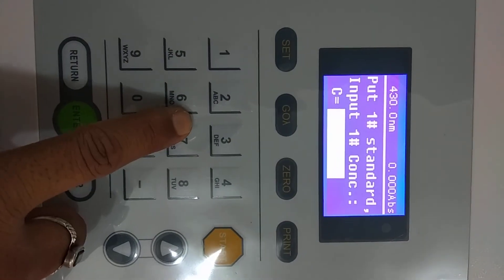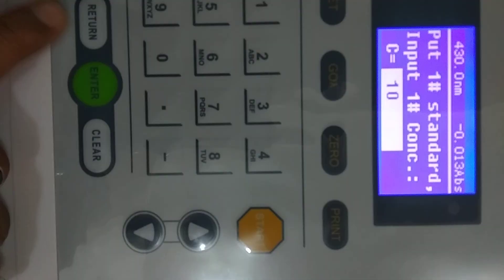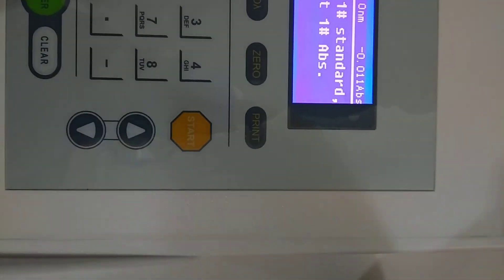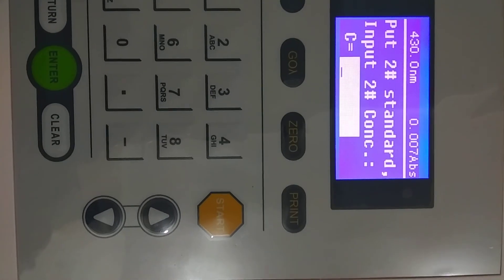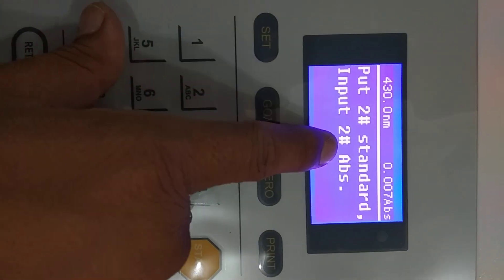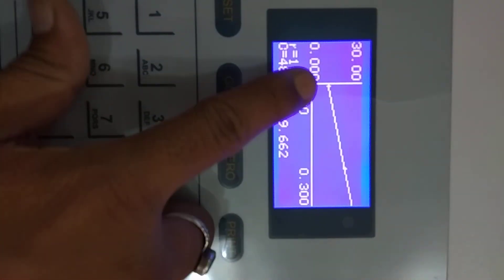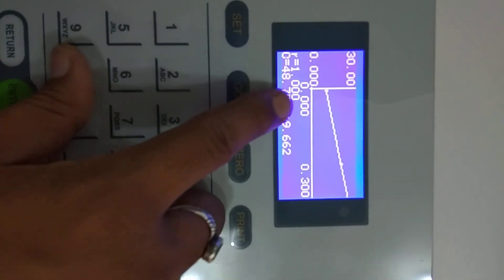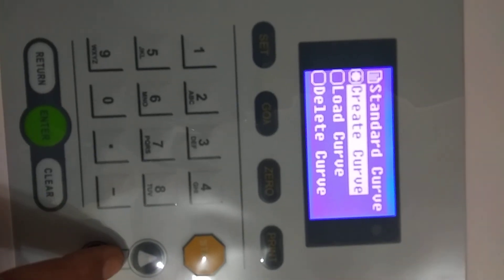Enter the concentration value of your first standard sample — for example, 10. Place your standard samples and press Enter. The system will ask you to put standard solution number one and will display the absorbance value. Then enter the second concentration value, such as 20, press Enter, and place the second standard. The graph is then plotted, showing absorbance on one axis and concentration on the other.